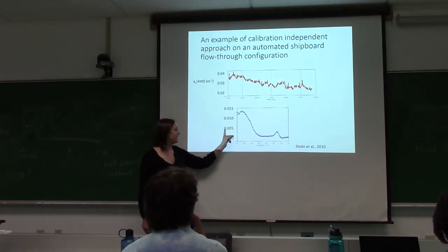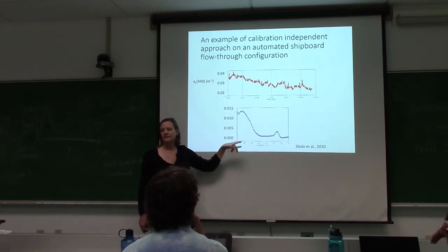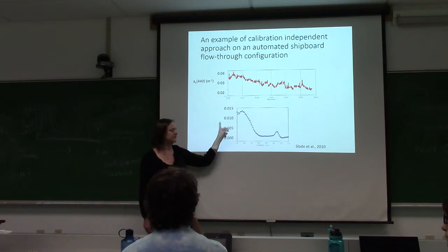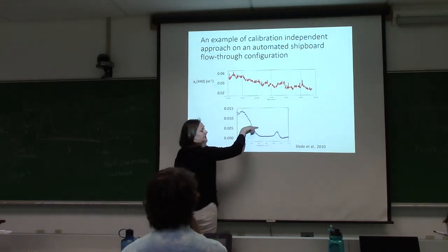And I will just say, crazy low values. The resolution on the instrument from the factory is 0.005. That's the best they can get you in terms of absorption per meter. Uncertainty, not the resolution. I'm sorry, the uncertainty. So they say that they can resolve you to here.